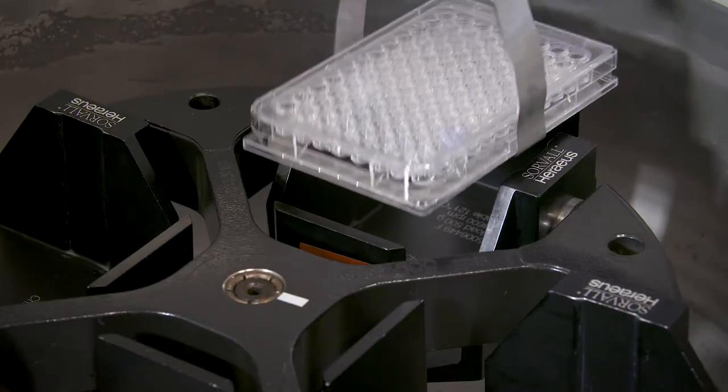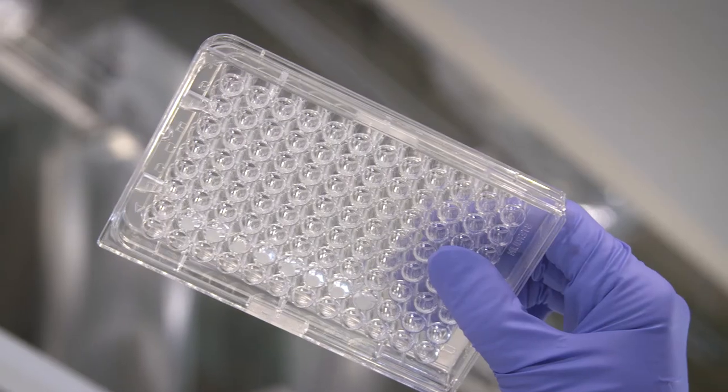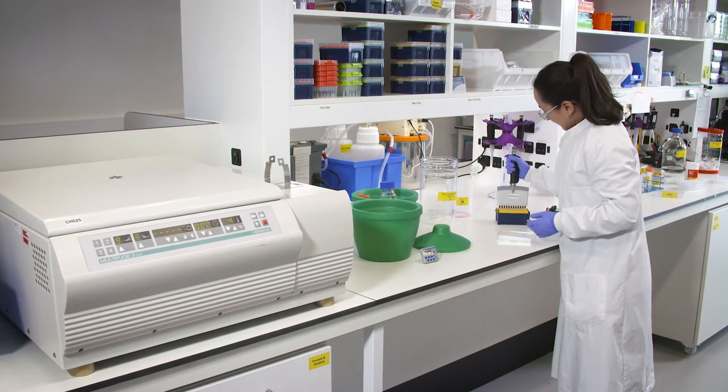Centrifuge your cells at 200 g's for 5 minutes. Make sure the pellet is visible in the plate, then discard the supernatant.